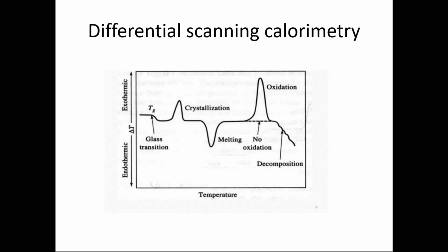Now let's move to differential scanning calorimetry. This is a graph showing different events possible to observe on differential scanning calorimetry.